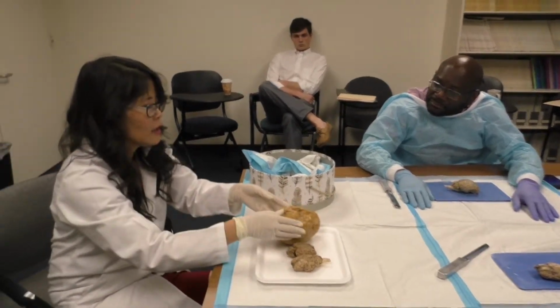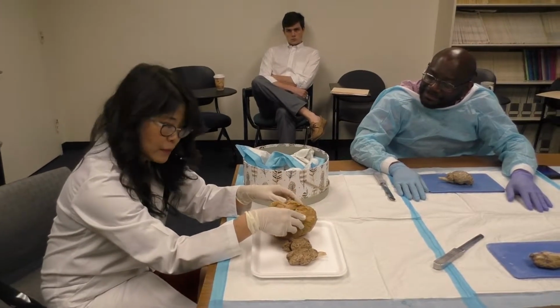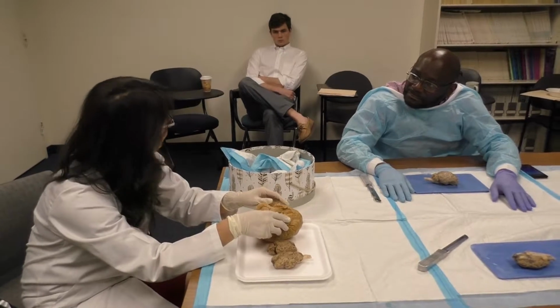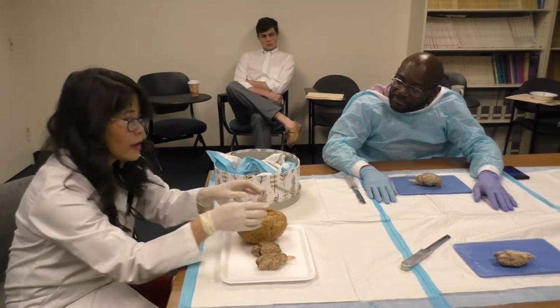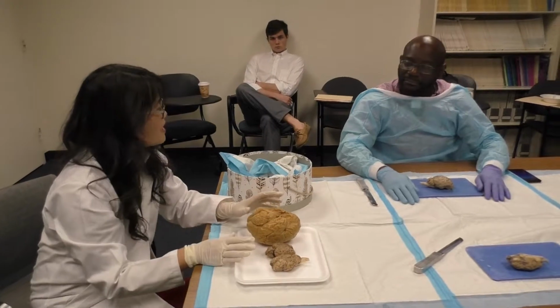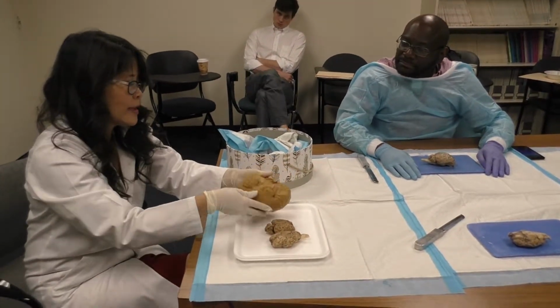And then finally, we're all experts now, or you guys are real experts on the temporal lobe. Higher order visual processing, long-term learning and memory through the hippocampus, and emotional processing via the amygdala, all down there in the temporal lobe. So those things can be pointed out in the pictures once you make the atlas.